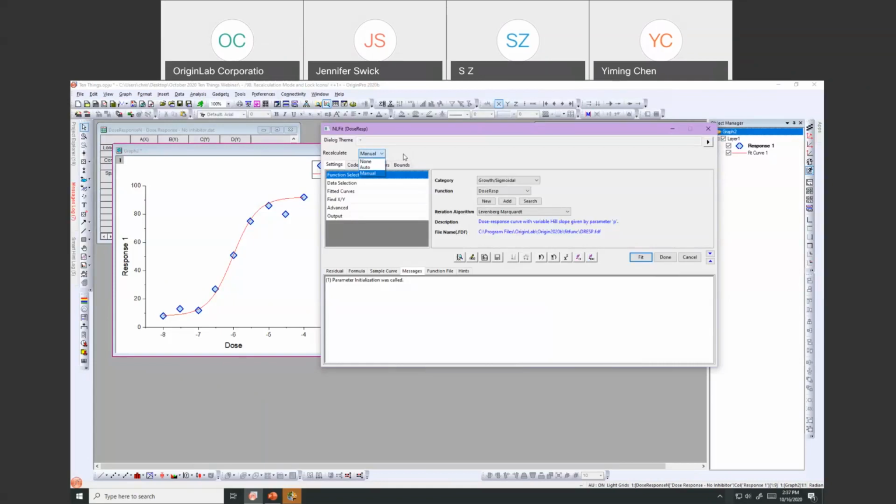By default, many operations are in manual mode. What that means is when that source data changes, the analysis is going to stay as it is, but there are going to be visual indicators, and I'll tell you about that in a minute, that say you need to rerun that analysis. You need to recalculate it. That's manual. None means you're just doing that analysis one time. For example, maybe I'm only doing this fitting one time. I actually don't want Origin to watch the source data. It's one and done. Rarely, if ever, do I see anyone do that.